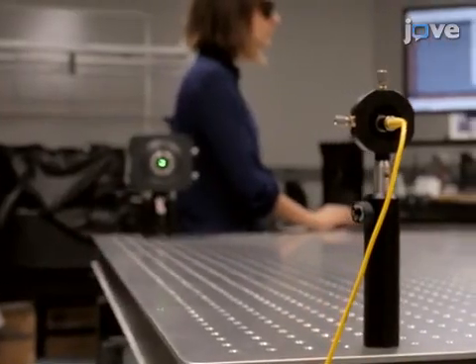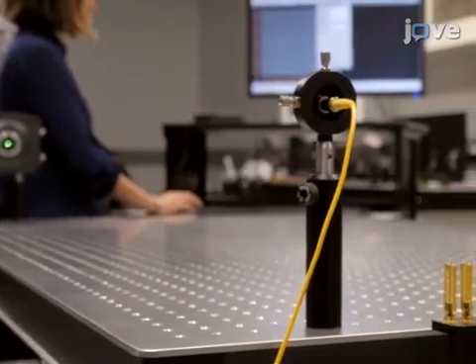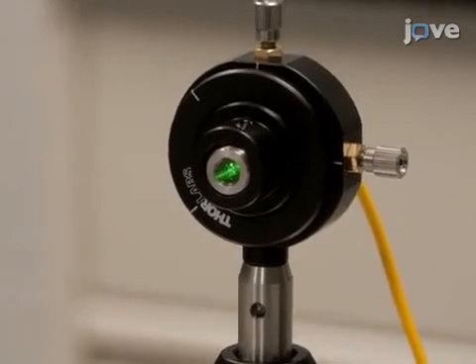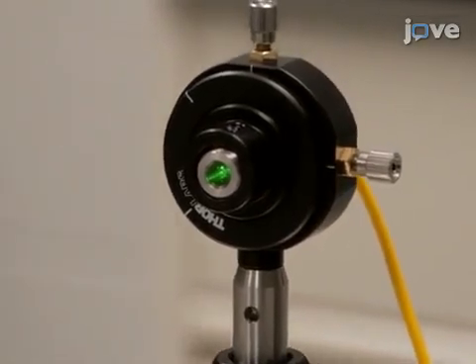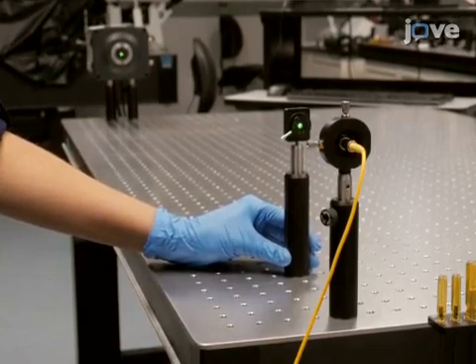Approximately 1600 millimeters in front of the camera, place a fiber collimator at camera height. Connect the collimator to a single longitudinal mode laser and use a laser power of less than 0.1 milliwatts.